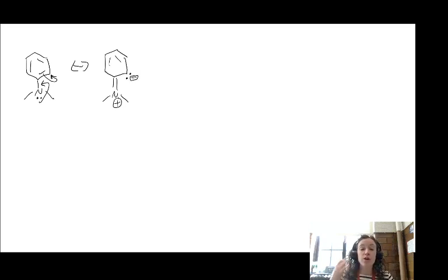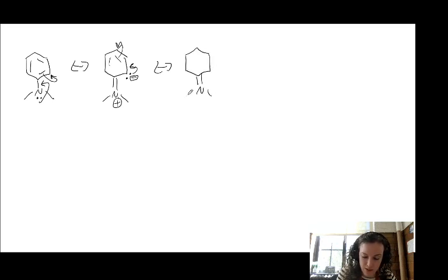So these electron donating groups create these beautiful kind of carbanions on the benzene ring. We can draw another resonance structure. And I'll make sure not to accidentally draw too many double bonds this time.